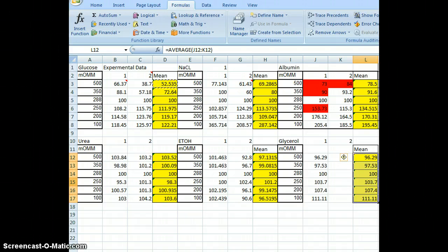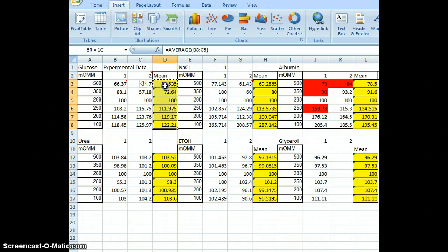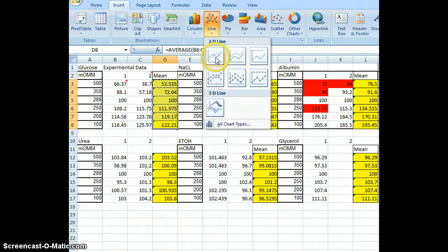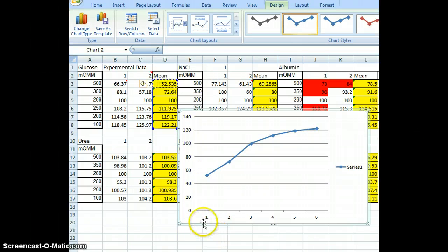I want line graphs. So I'm going to go over to Insert and highlight those five values — that will be my first series. I'm going to do a line chart and select the option with dots to get a line like this. One problem: I have the wrong axis units.